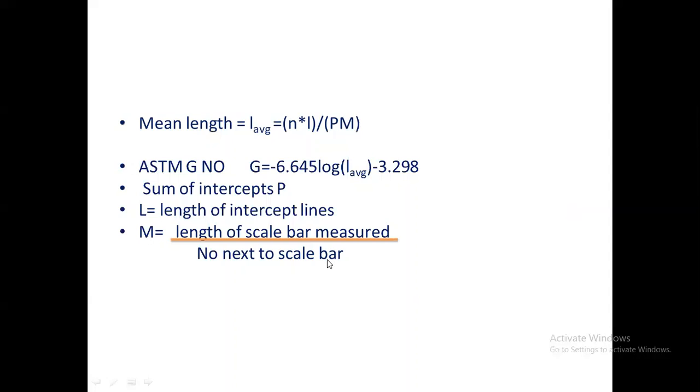In this microscope image the number next to the scale bar is 200 microns, and what it scales to on your bar of scale is the M. We are going to see how to calculate the effective M in the next slide. For now we can consider M as the effective magnification.